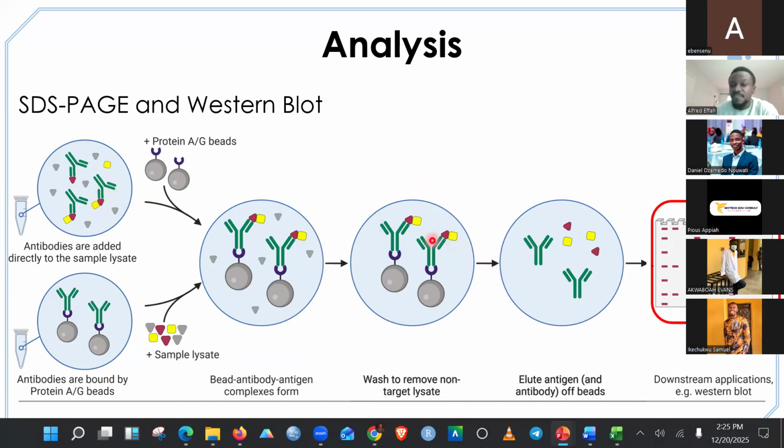When we wash, if it is interacting with A, then that interaction should still be there. So over here, we are seeing all these things because of A, because we detected A. So whatever we stain for, when we see X here, it tells you that it came with A. It was able to end up here because it was part of A. Mind you, when we wash, if you are not part of this complex, we are going to lose you.